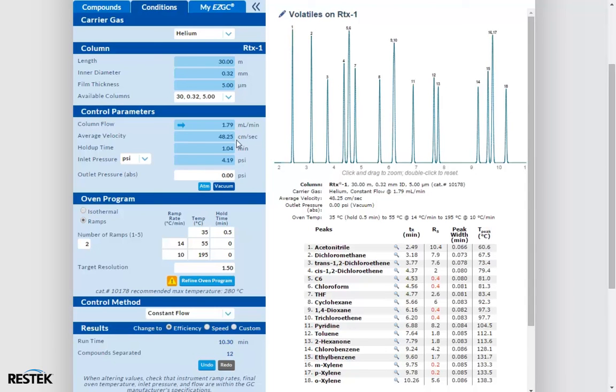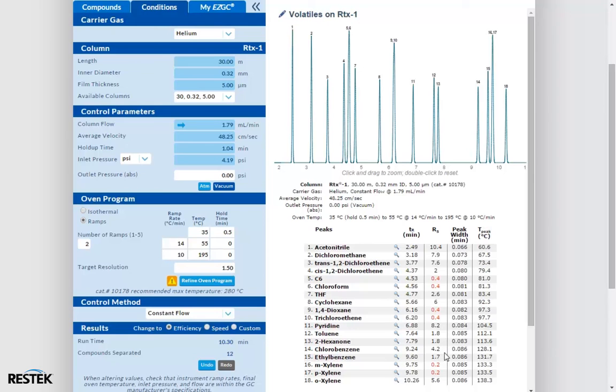We can see that we have a slightly shorter runtime, and we've actually improved the resolution between toluene and 2-hexanone. Also, because we made changes, our refine button is available again. So let's see what we get.